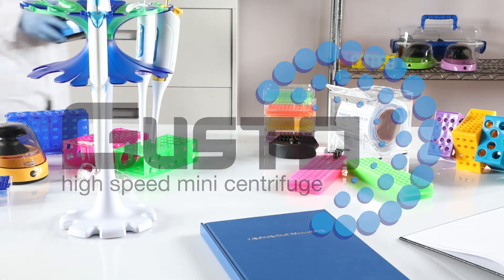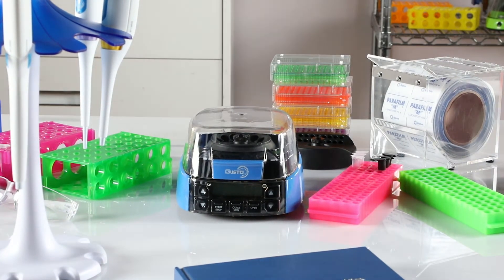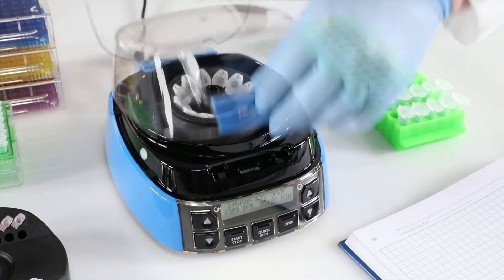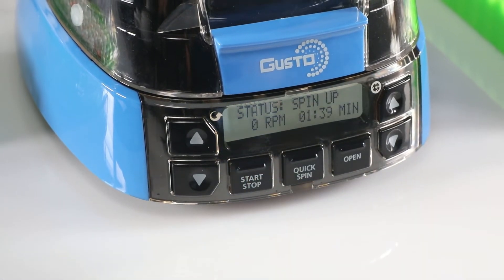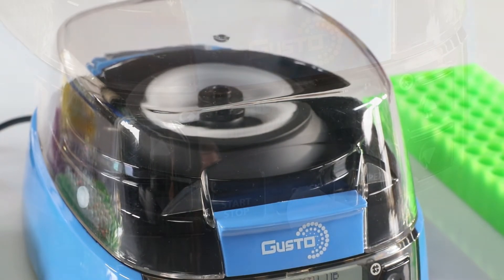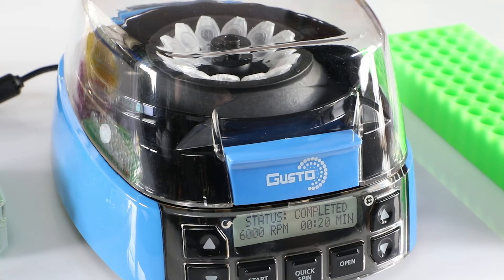Maximum speed, minimal space — that's what makes the Gusto high-speed mini centrifuge the perfect choice for any size workstation. To operate, just insert your tubes, close the lid, adjust the speed and time, and press start. For duplicate spins, simply reload the rotor and press start. There's also a quick spin option for commonly used 20-second cycles.